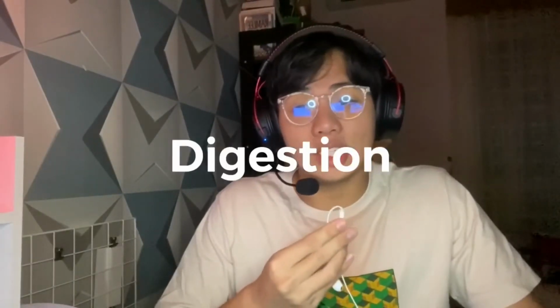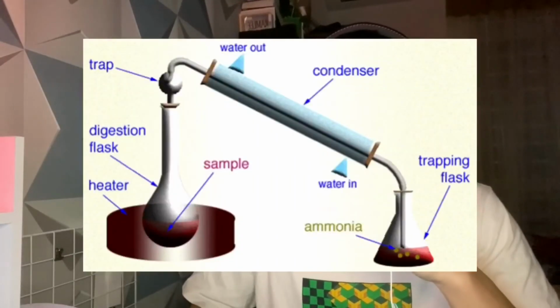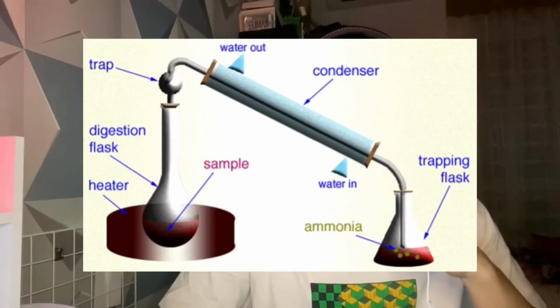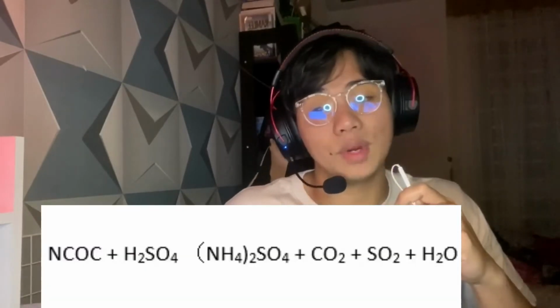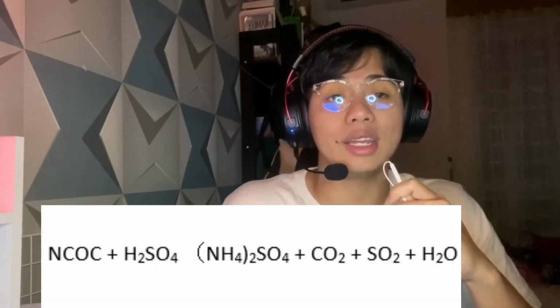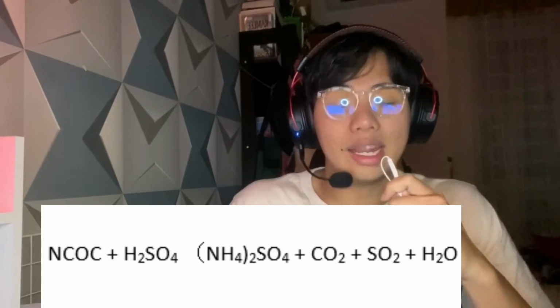For the digestion, the purpose of this step is to break down the bonds that hold the polypeptide together by digesting the protein in sulfuric acid with anhydrous sodium sulfate and a catalyst, which can be selenium, mercury, or copper salts, and convert them into simpler chemicals such as water, carbon dioxide, and of course ammonium sulfate in the form of ammonium ion and sulfate ion.